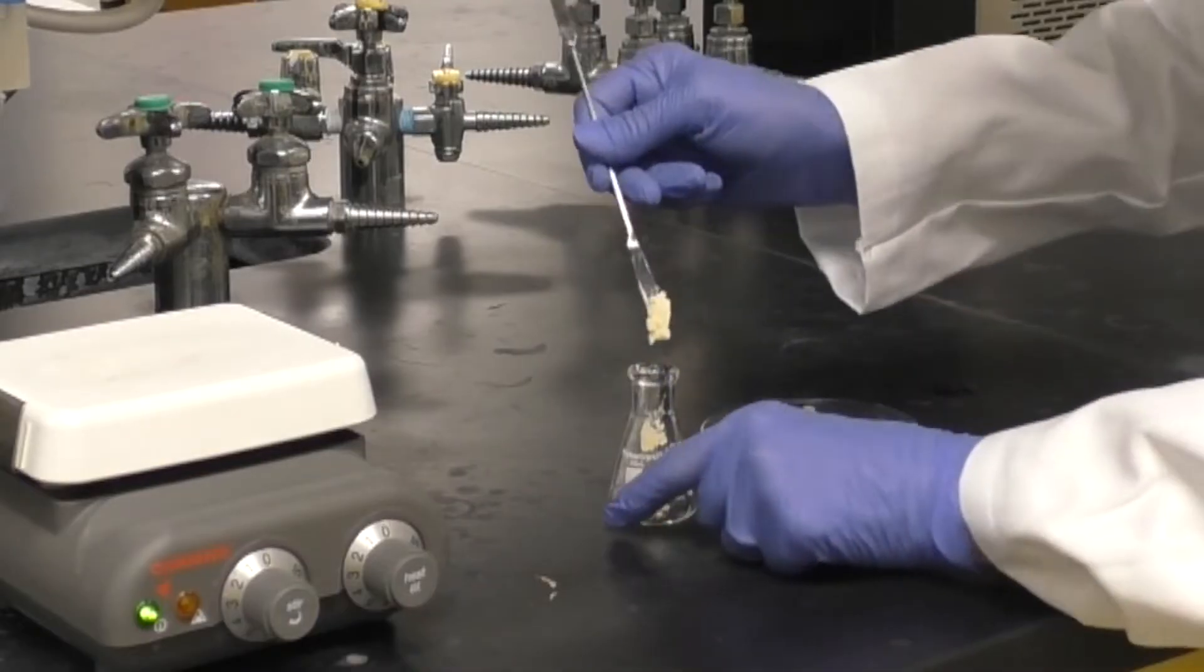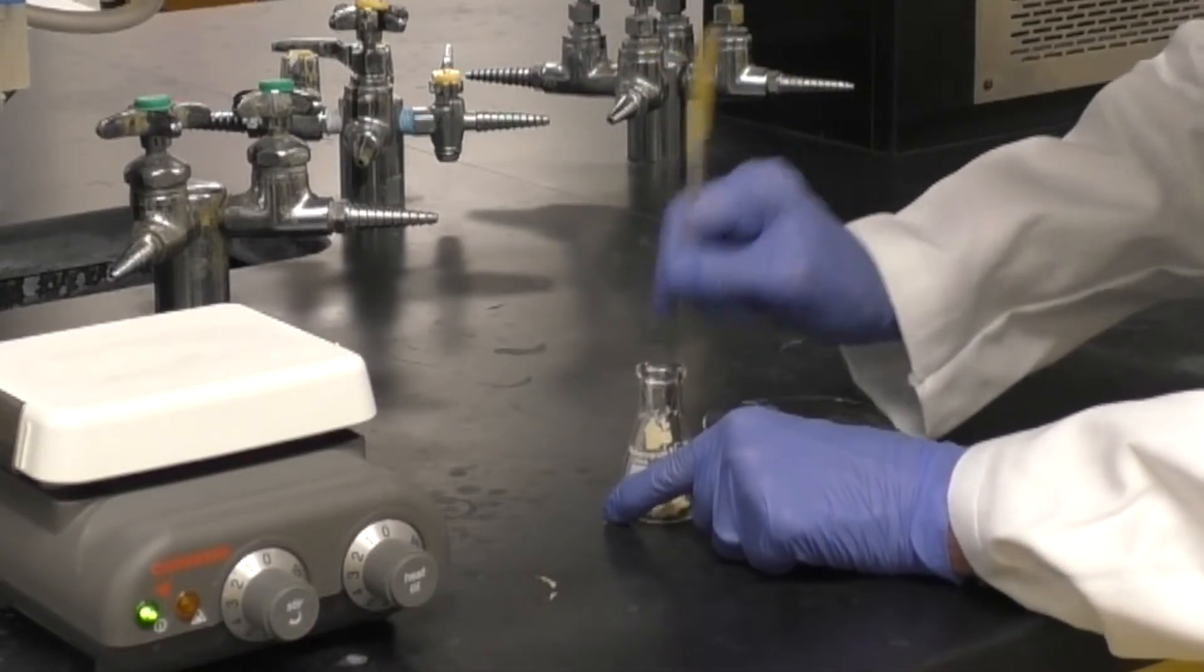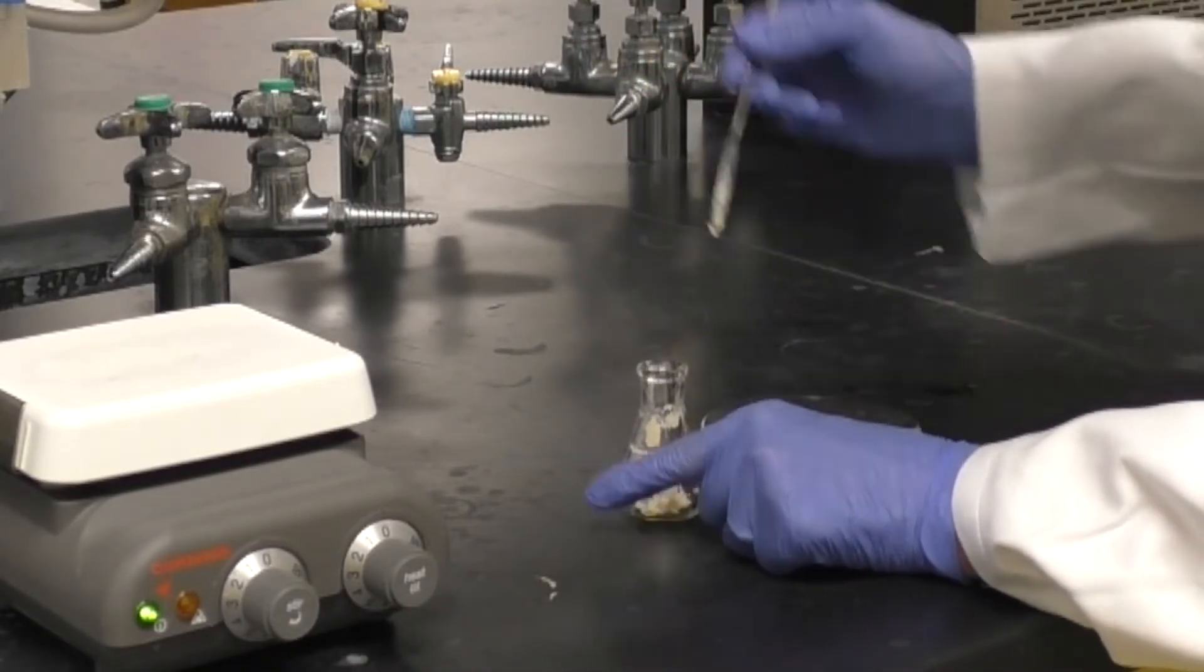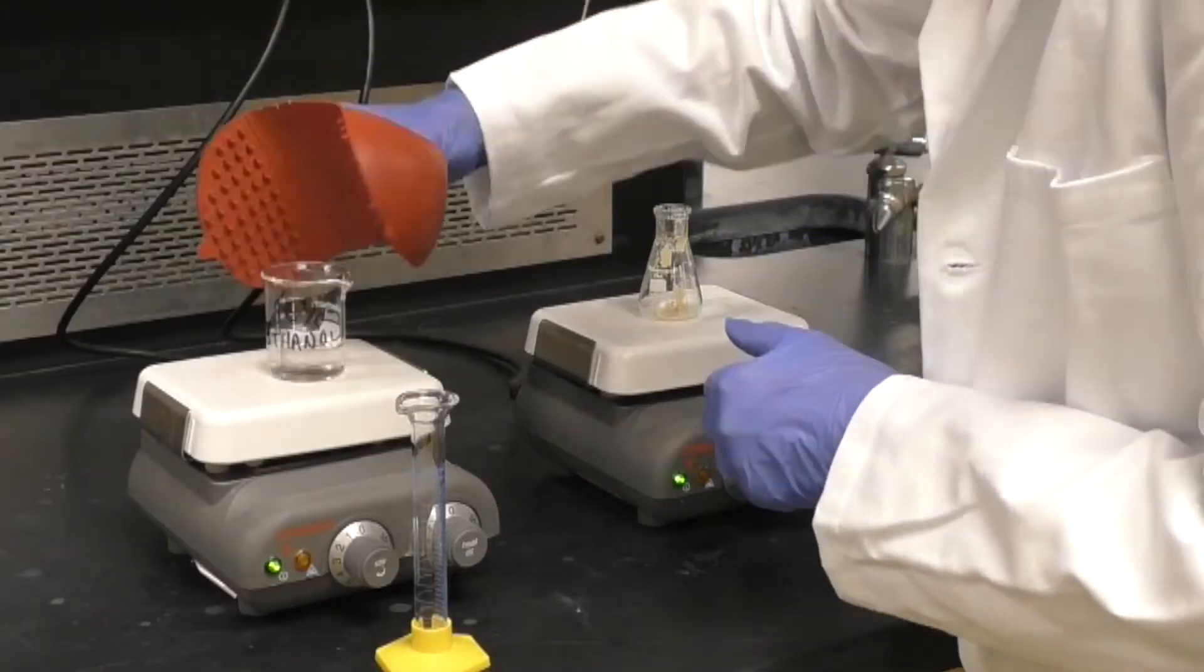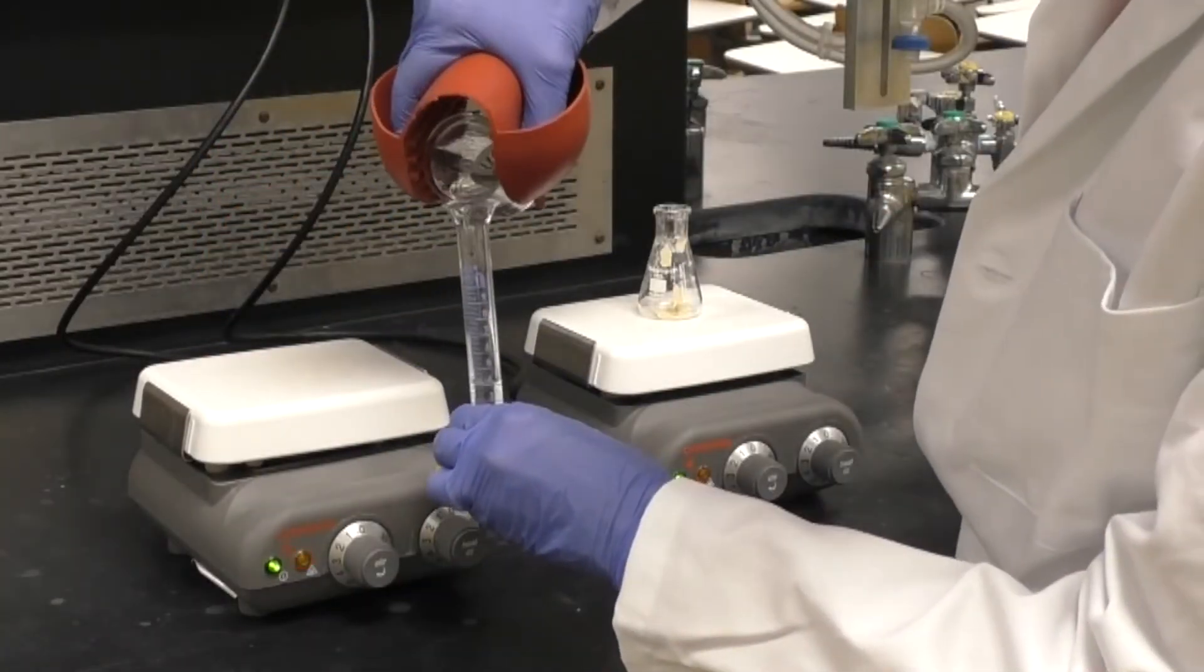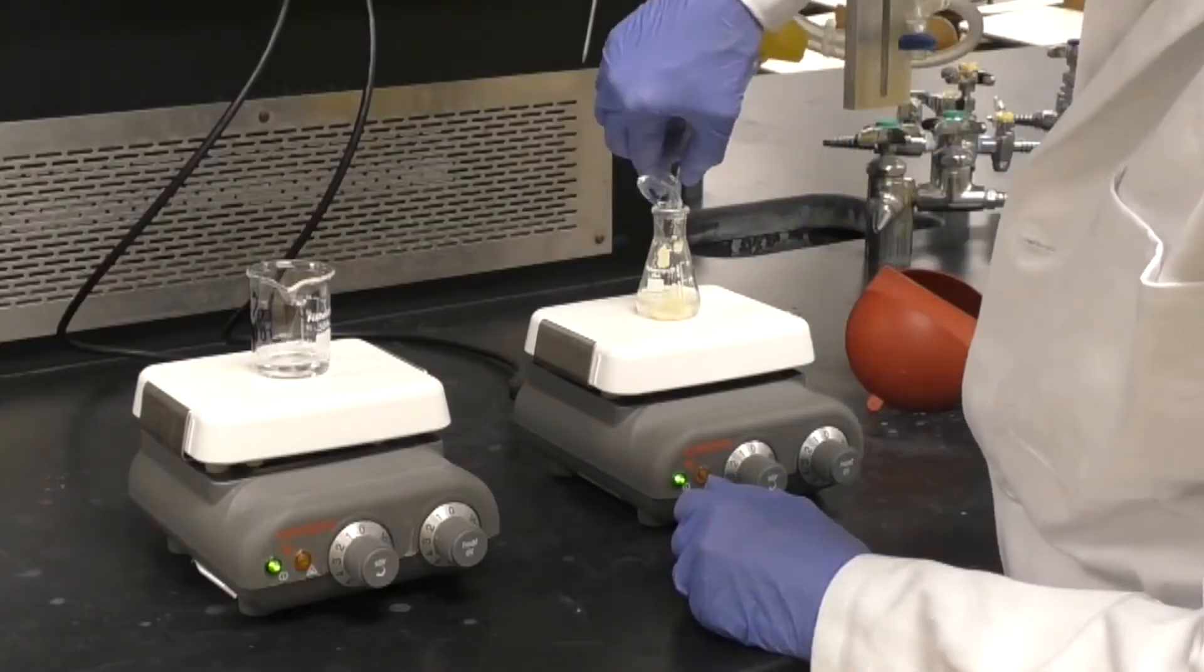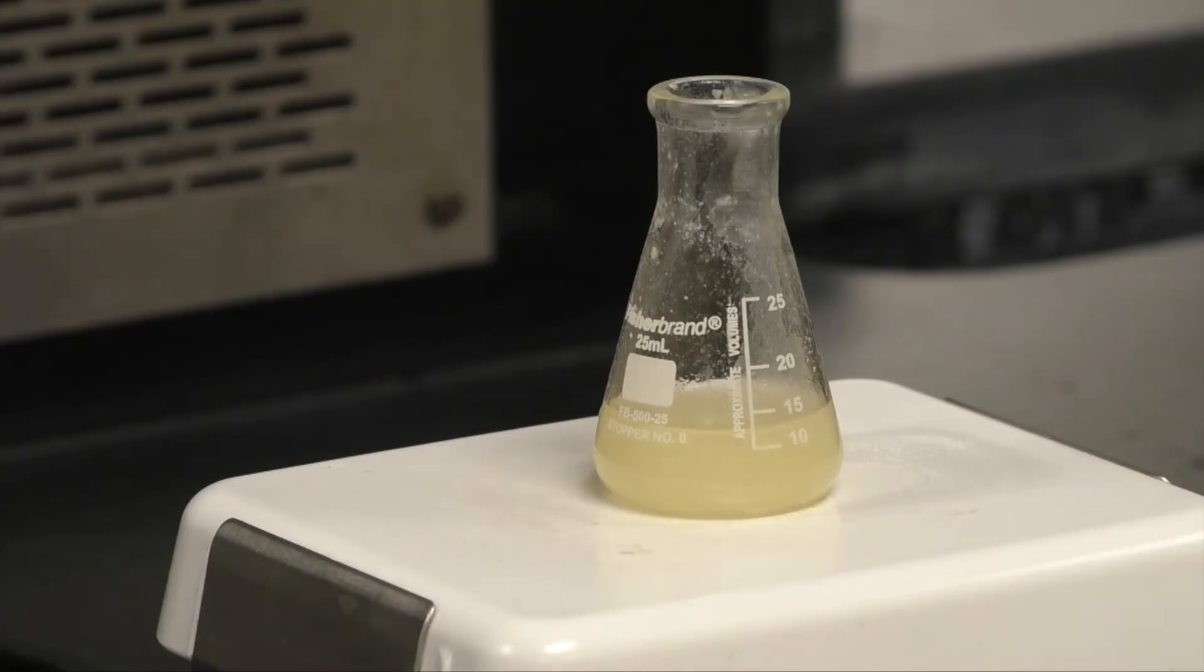To recrystallize the crude product, transfer it to a 25 milliliter Erlenmeyer flask. Add 10 milliliters of the boiling ethanol and stir. Add up to 5 more milliliters of ethanol, but only add the minimum amount needed to dissolve the product.